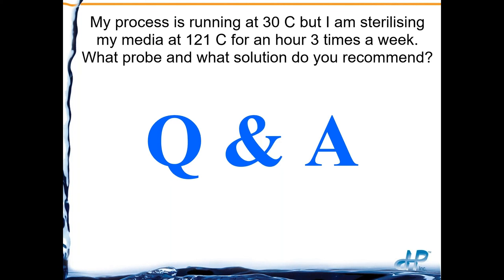Next question is, my process is running at 30 C, but I'm sterilizing my media at 121 C for an hour 3 times a week. What probe and what solution do you recommend? You need to make sure that you're using a heavy-duty glass, the thickened glass, and you're also going to need to make sure that you're using the salt crystals, the thicker one.